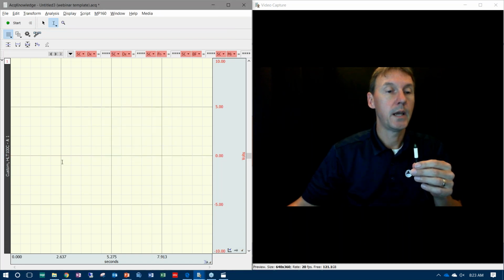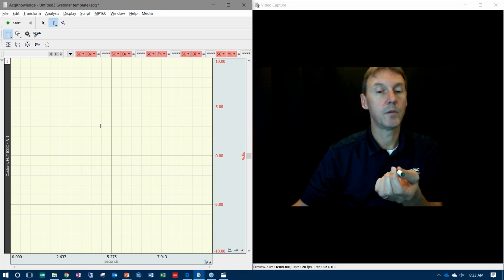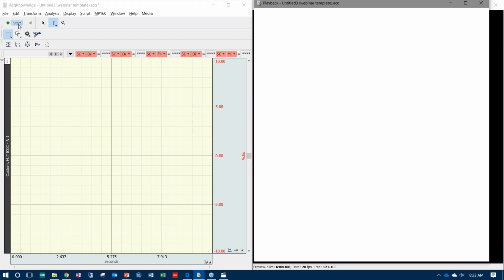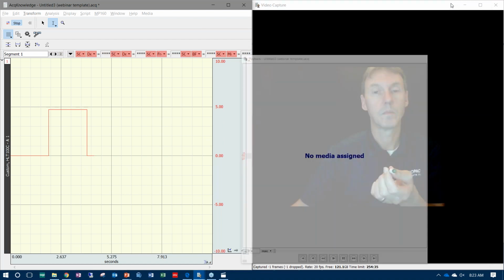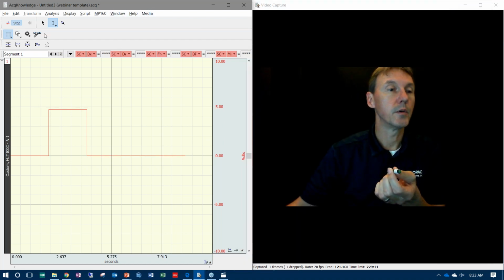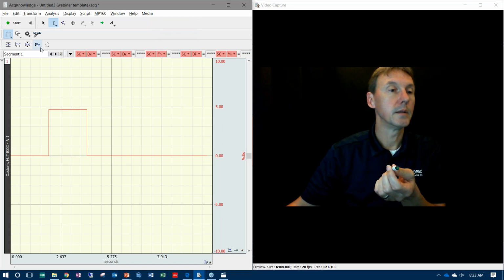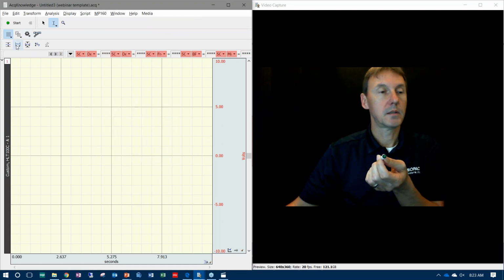Okay. So we're now back at 0, and I'm going to turn this around so that hopefully we'll be able to pick this up. I hit start. Sorry, that wasn't very helpful. Let me do that again for you. And I'm going to turn off the playback viewer. And we'll do that again, and hopefully this time you'll actually get to see what happened. Okay. All right, so let's try that again.